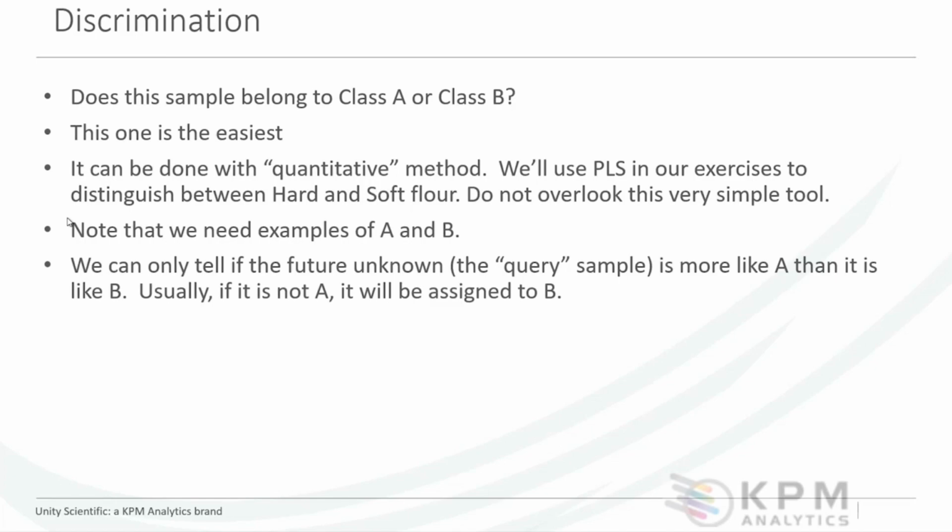Basically what this evaluation does is it looks at your unknown samples once you've created this model, and it determines the similarity to product A and the similarity to product B. And you are determining which one it is more similar to.